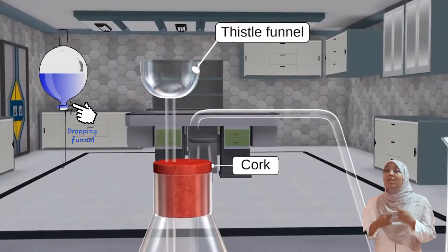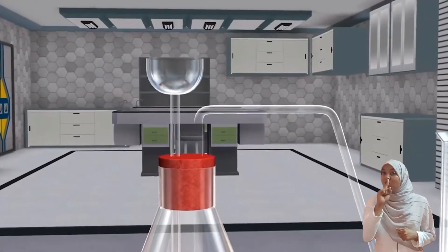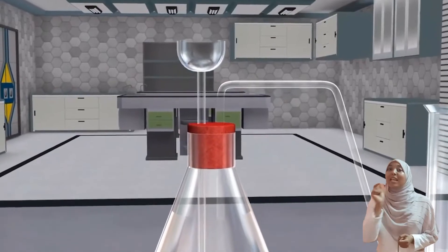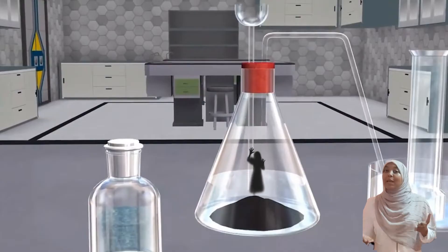You can use a thistle funnel or a dropping funnel. A dropping funnel is better because it has a tap to regulate the liquid flow. If using a thistle funnel, the end should be immersed in the liquid to prevent escape of the gas produced, which in this case is oxygen.